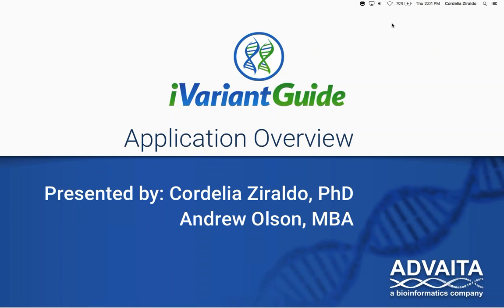Thanks, Andrew. Hi, everybody, and welcome. Today, I'll introduce Advaita's brand new variant analysis application, iVariantGuide. It's so new that it's still in beta, which means that for now it's completely free to use. I hope that by the time we're done today, you will feel confident enough to try iVariantGuide with your own data and see its power for yourself.